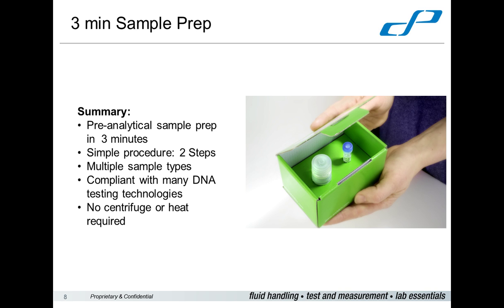And the main point about this as well is the fact that there's no centrifugation, there's no heat, there's no washes, there's no waiting for ages for specific things to be heat inactivated or whatnot. It's simply just into tube 1, transfer to tube 2, and that is it.